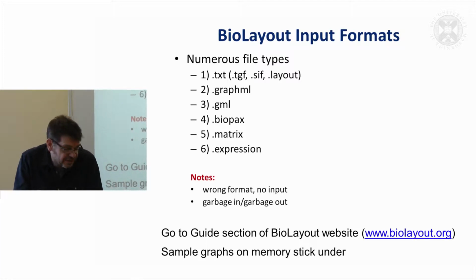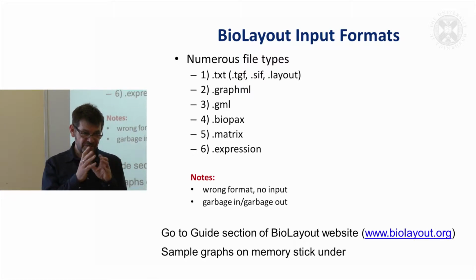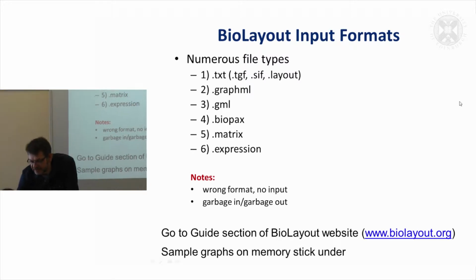Okay, so the first thing is getting your data in here, and what I'm going to start with is some very basic data formats. If I jump you all into a big graph straight away, then it might be a bit confusing. So in terms of getting you orientated to the navigation and the basic concepts of graphs, I'm going to start off with some easier data sets.